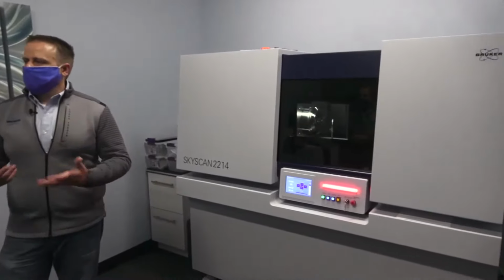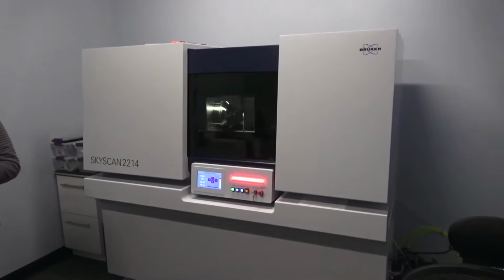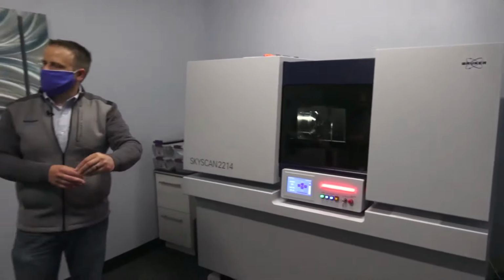So you actually get into that nanometer scale with these things? Absolutely. So that's really on the order of those traditional light microscope type solutions, but this is also giving you the internal structure. Correct.